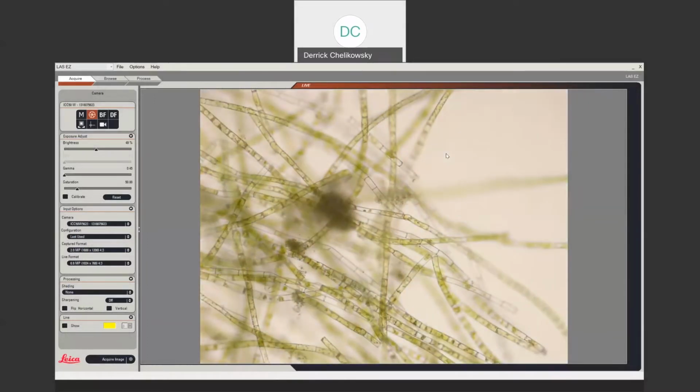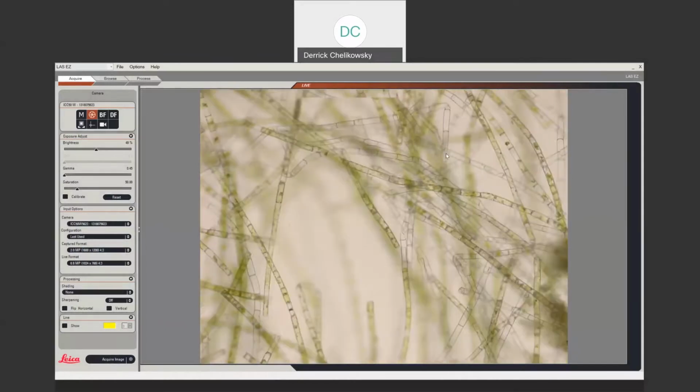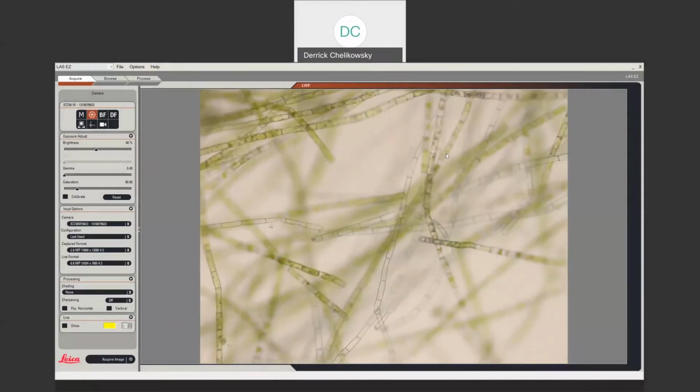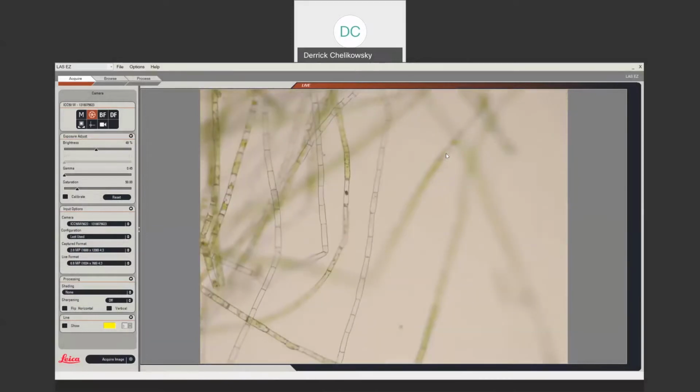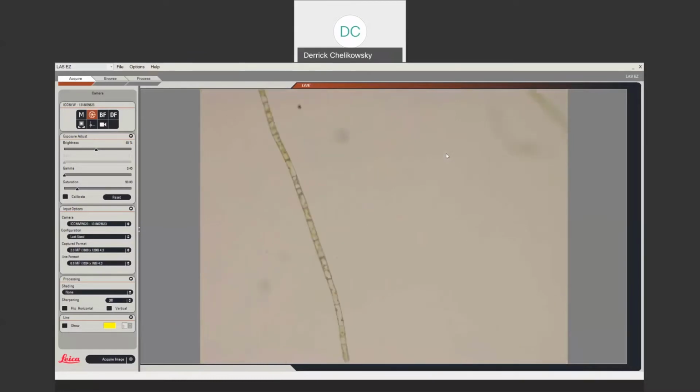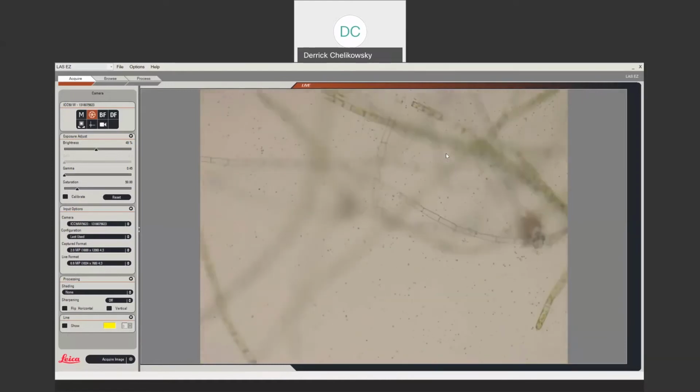Or maybe it was just a clump of cells. Let's take a look and see if we have any here. Now, this is 10x, and if you take a look, it's actually really easy to see this at this power, unlike some of the other cells we've been looking at, which are significantly smaller. Let's peek around here. See what we can get. Not seeing any antheridia. Seeing a fair number of spores.